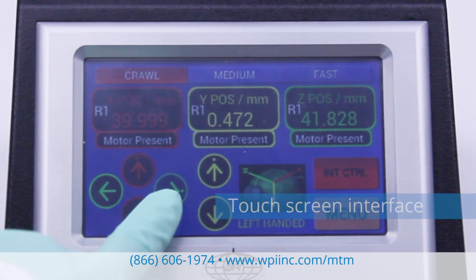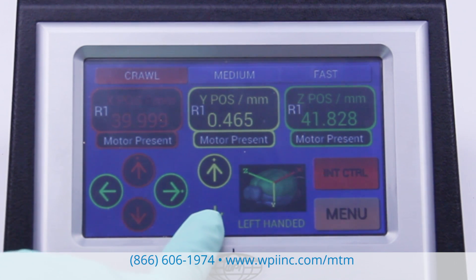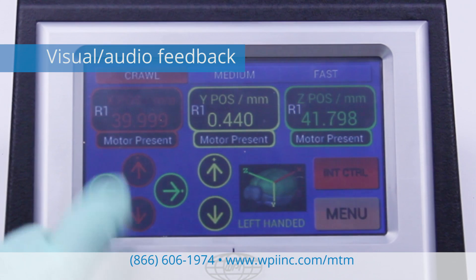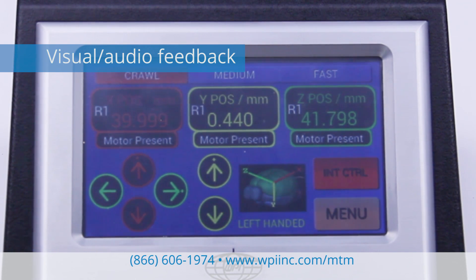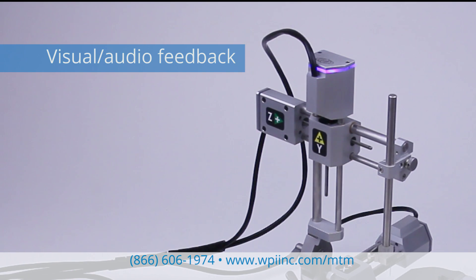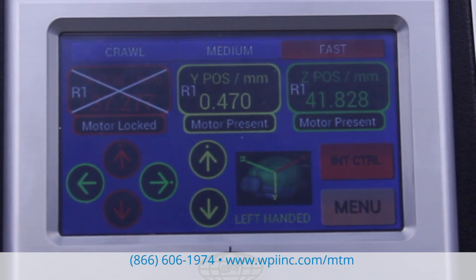The controller has a touchscreen interface. To move any of the axes, press the arrow on the controller touchscreen. If sound is enabled, the controller emits a tone to indicate that a motor is attempting to move. At the same time, the LEDs on the corresponding axis illuminate when the motor is moving. To prevent accidental movement, you may lock any or all of the axes.